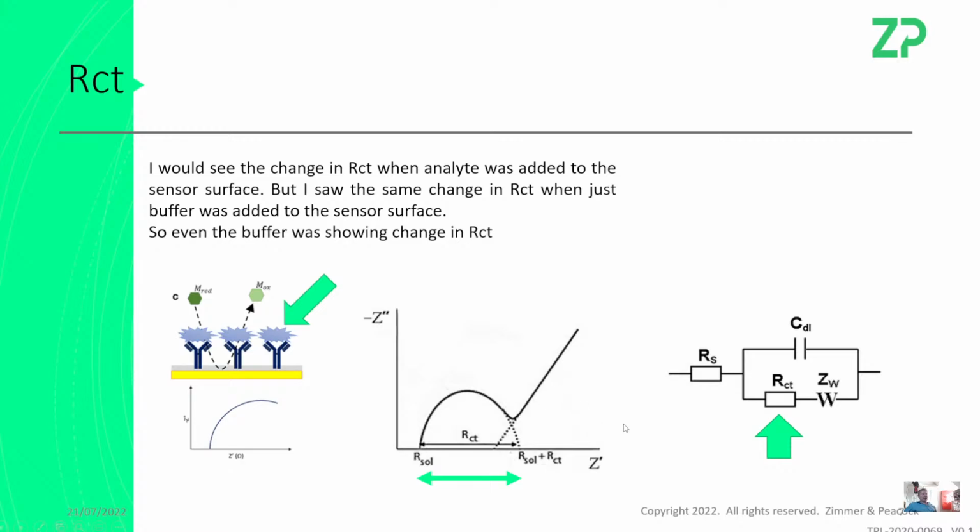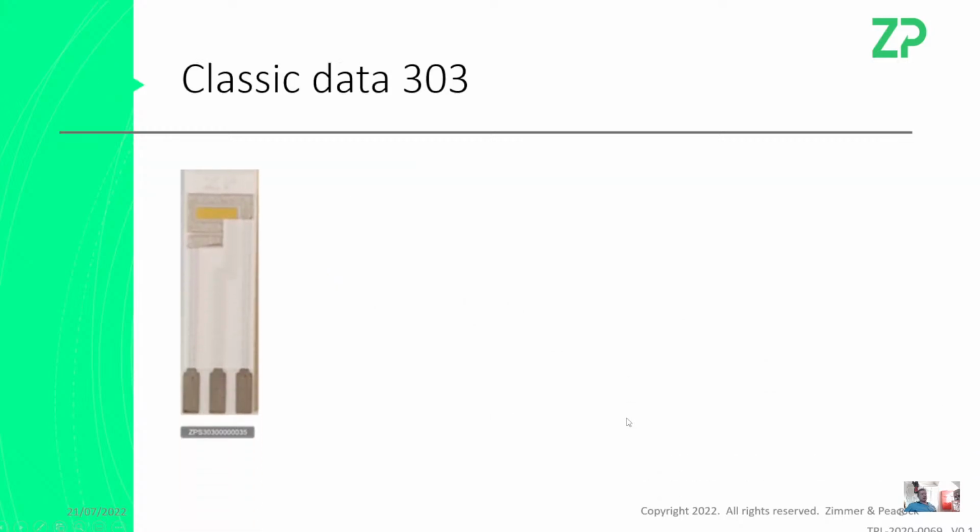First of all, I don't think they're necessarily on ZP electrodes, and I could be wrong on that. So it's hard for me to understand necessarily what's going wrong here. I do want to say that this kind of approach can work. Here's a ZP gold electrode, a ZP value electrode.